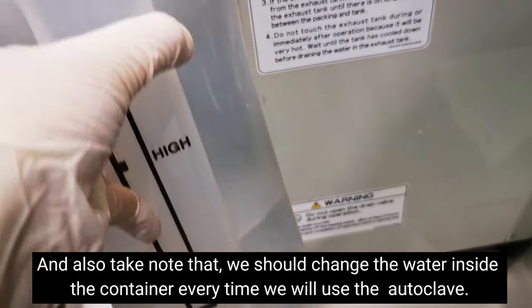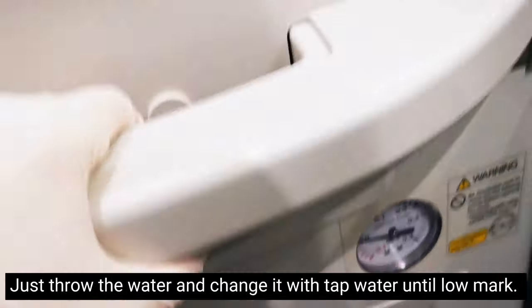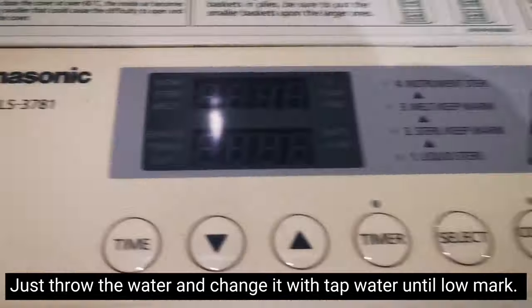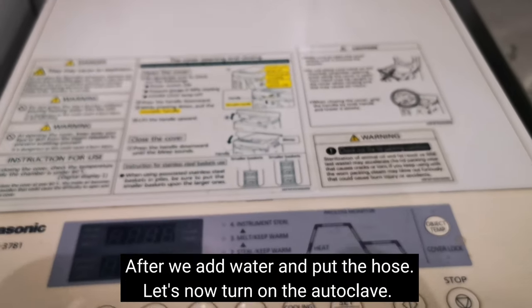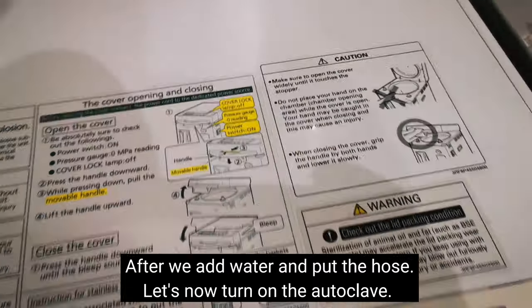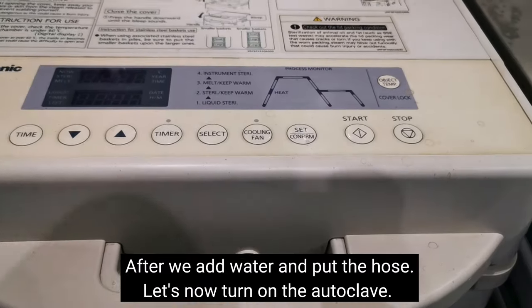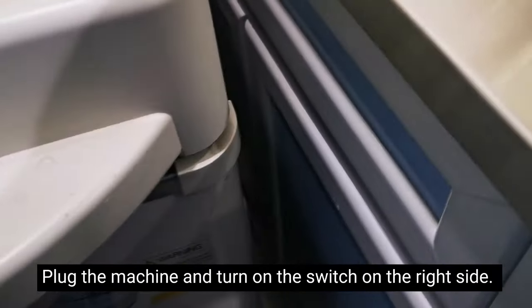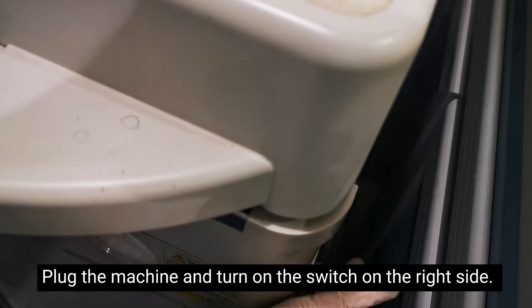We should always replace the water up to the low mark. We'll dispose of this water for the next use of the autoclave and replace it with tap water — water from the faucet is fine. After adding water and placing the hoses in the correct holes, we can turn on the machine. Just plug it in and there's an on/off button on the side — flip it up to turn it on.